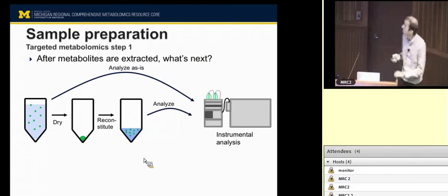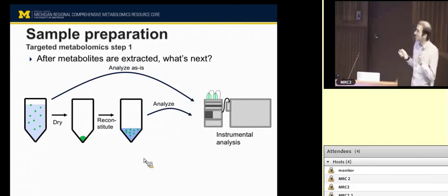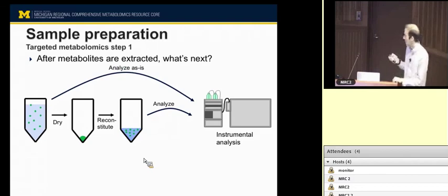Okay, so Chuck already showed you the slide. You probably already read it when it was up on his screen, but I think it's worth taking some time just to define these terms: targeted metabolomics and untargeted metabolomics. What makes a targeted and an untargeted study distinct? What makes them the same? And eventually, how are you going to pick between them when you have to start an experiment?